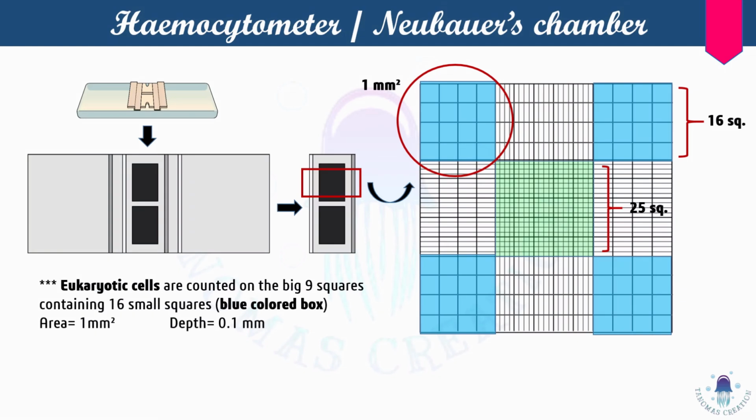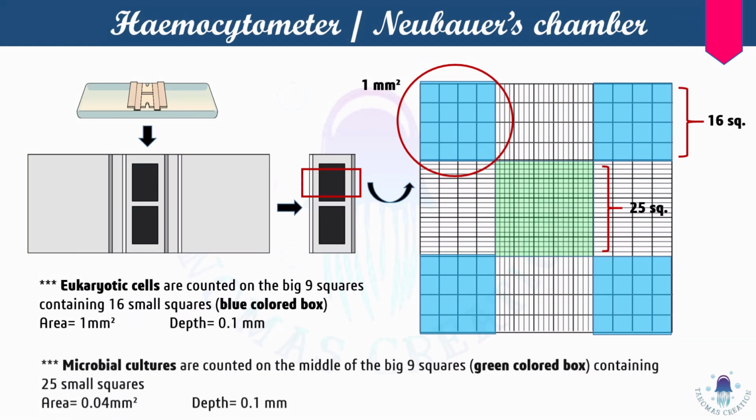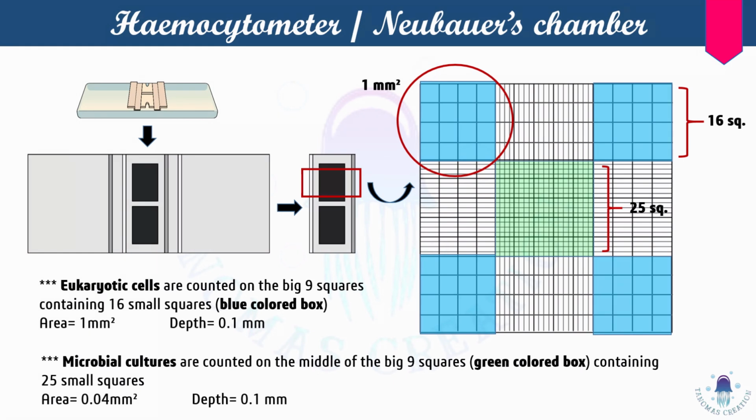Since they are larger, they will be counted in the blue squares, which have an area of 1 mm square and a depth of 0.1 mm. Whereas the microbial cultures are counted in the middle of the 9 big squares, which is colored in green and contains 25 small squares. Microbial cells are 10 times smaller than eukaryotic cells, so we cannot count them in the larger ones. We need the smaller ones. Because of this, the middle green one is used for microbial counting. The area here is 0.04 mm square and the depth is the same 0.1 mm.